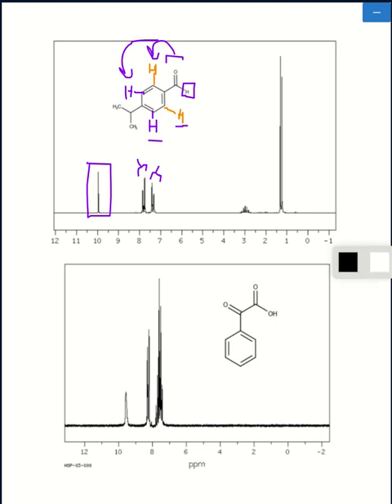And because this molecule is really great for signifying a lot of concepts, this carbon right here has one hydrogen that's not being shown, and the two methyl groups here and here, just based off of symmetry, the hydrogen on those carbons would show up as one peak, would show up as the same peak.